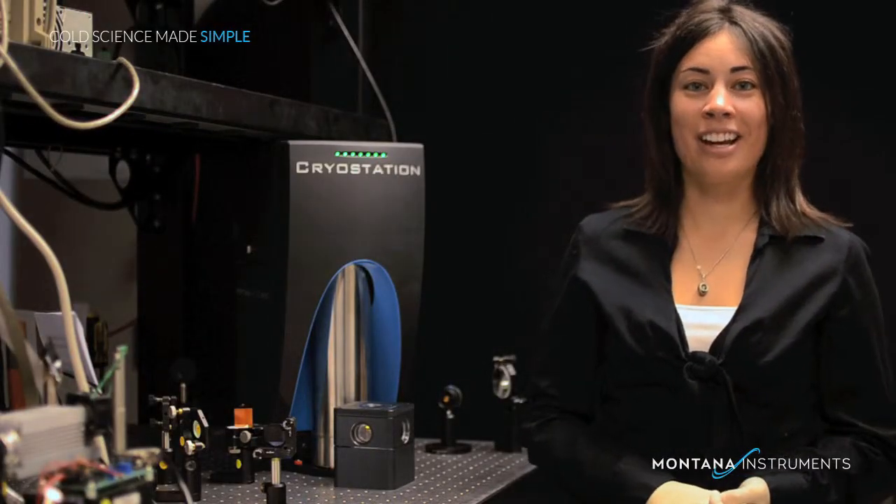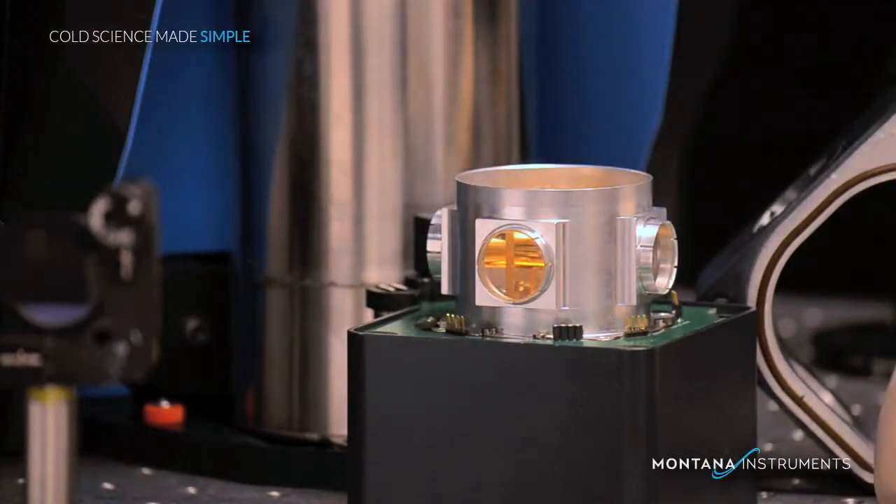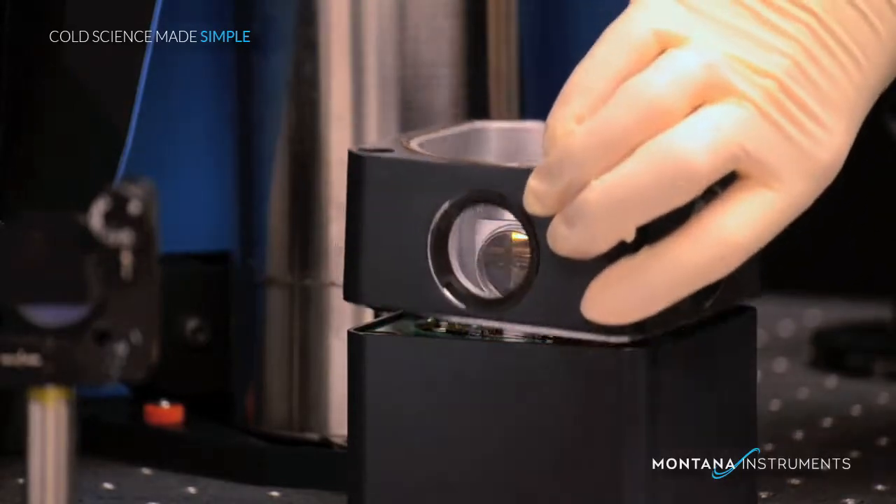Now let's put it all back together again. First, the inner radiation shield and lid — fasten this down with bolts. Then add the window assembly and lid again.